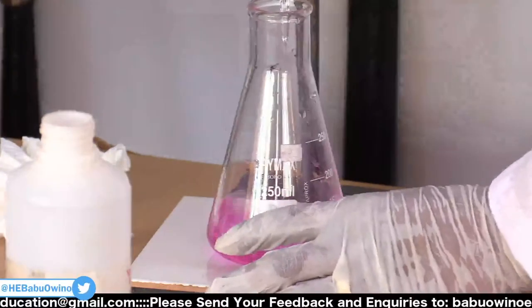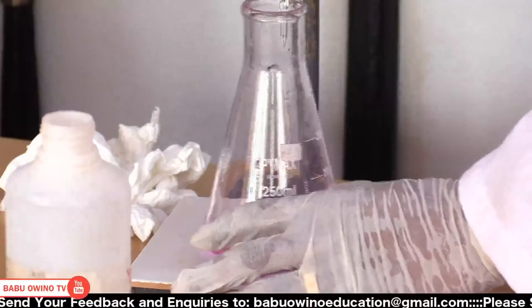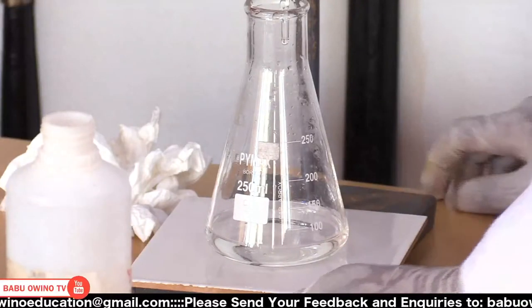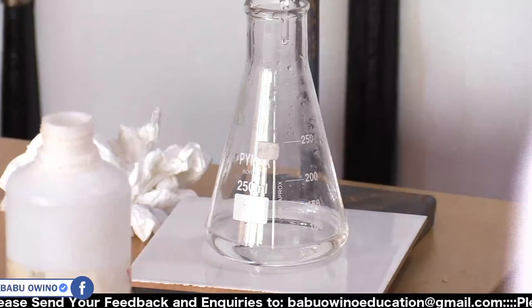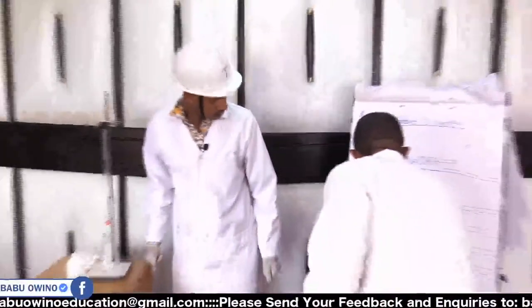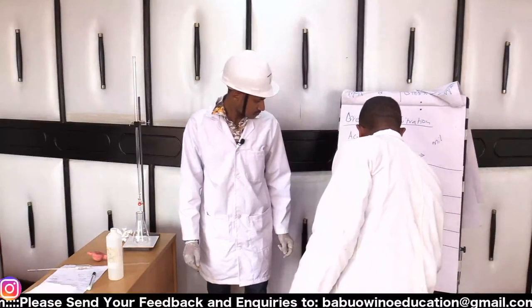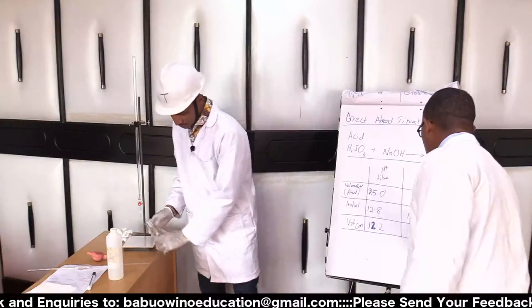So mostly the first titer normally is to know how you're going to move next so that you're consistent. Final reading, 25.0. So that gives me the volume. Is that correct? This is 2, yes. 12.2, correct. So we can start with the same 12.2 as our initial.